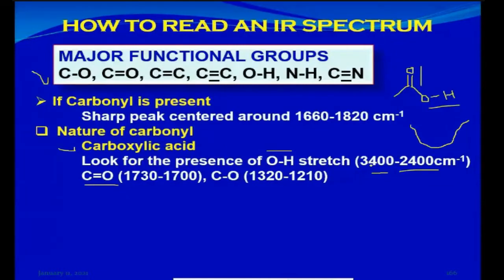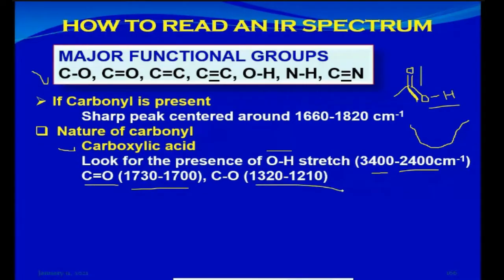If you see this broad stretch for the OH, it might belong to a carboxylic acid, and then you look in the carbonyl region. If you see a peak centered around 1700 to 1730 wavenumbers, then it is confirmed as a carboxylic acid. Along with this, there is also a carbon-oxygen single bond that would appear around 1200 to 1300 per centimeter, but the diagnostic peaks are the carbonyl and the OH — the OH being more prominent because it's a very broad, peculiar peak.